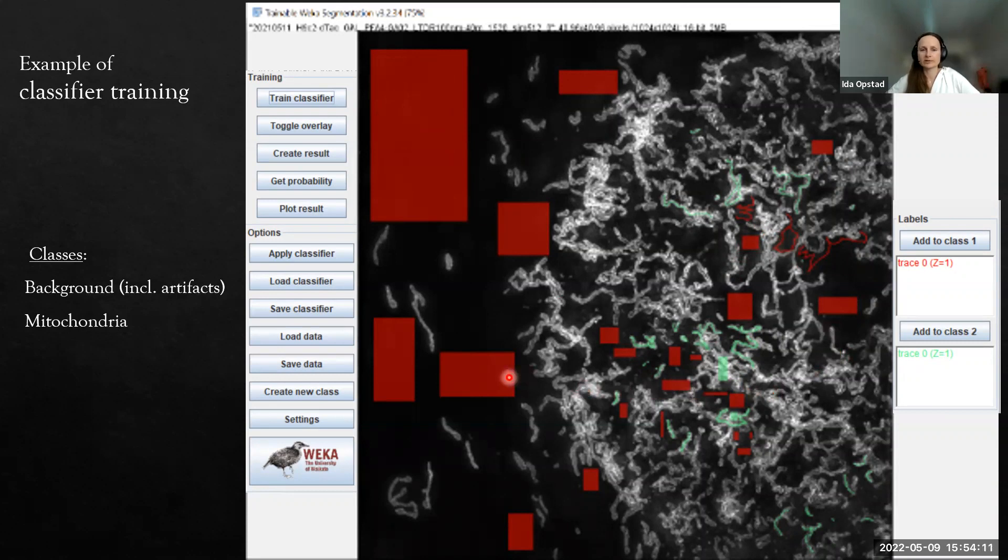I'm not sure how familiar you are with machine learning, but this is our training data then. We have one class of background and mitochondria as the other class, and then we can train the classifier. It instantly shows the results and then we can remark what went wrong and train again. It's quite quick and nice to use.